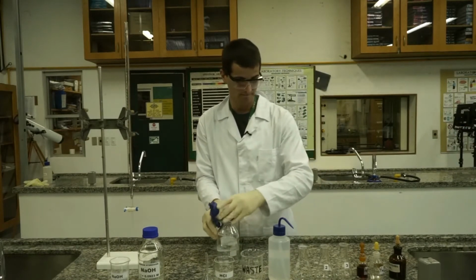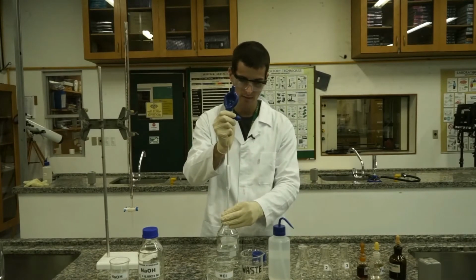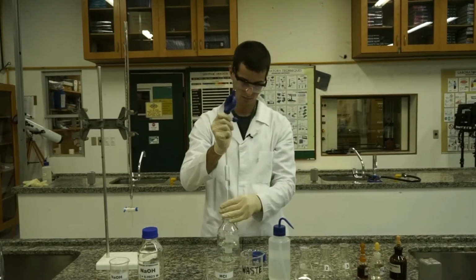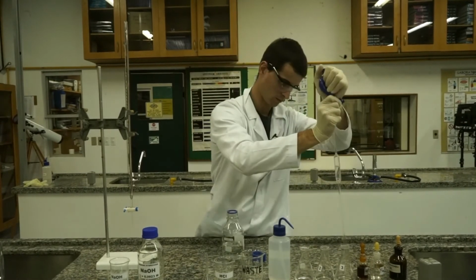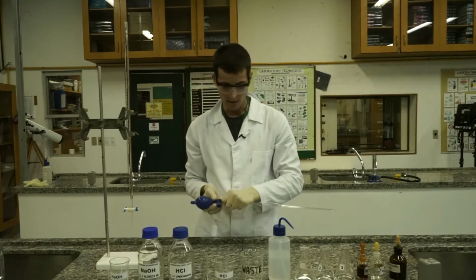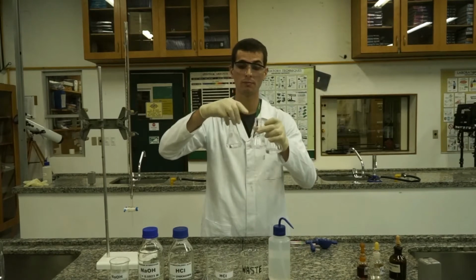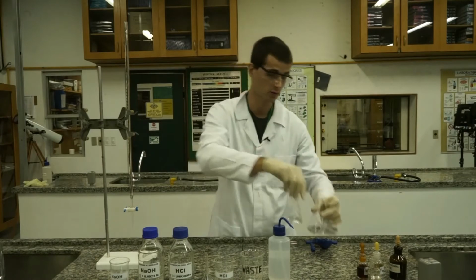Now, I'm going to drain up the liquid, the hydrochloric acid, and transfer it to the Erlenmeyer flask. Now the ANALYTE is ready. We have 3 here because we have to repeat the technique 3 times. We have to do 3 trials.